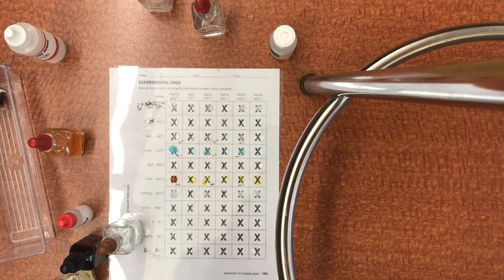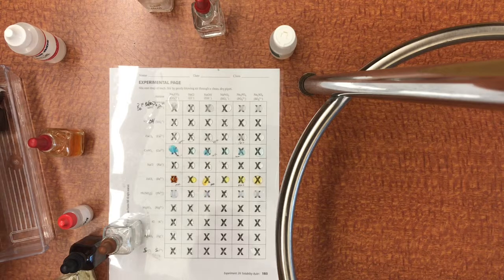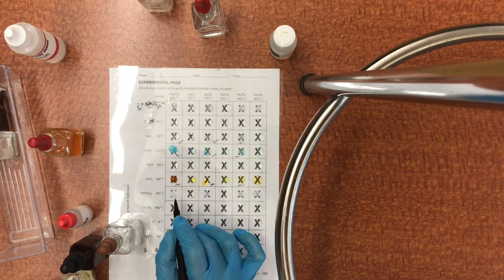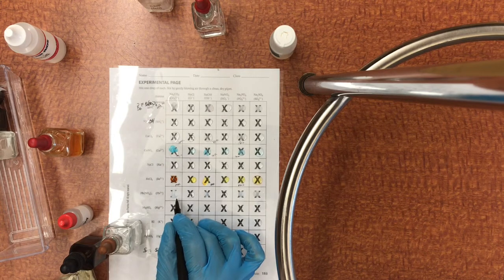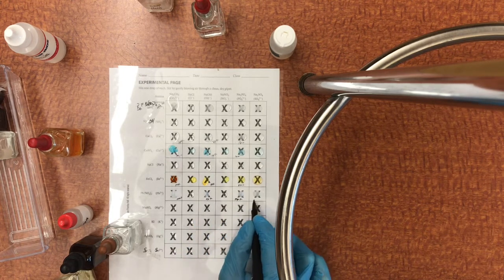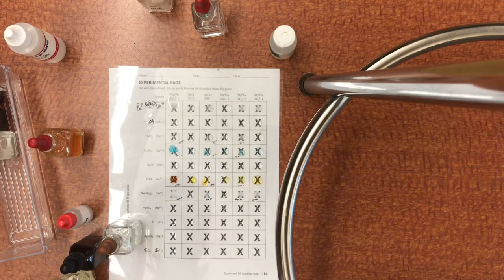It's a bit on the smaller side of the ions. It's also one of the metals, or especially the weak metals. It's in the main group, so it's below carbon. It's in the same group as carbon. So that gives it some interesting bonding abilities because of its s and p orbitals. So here we got a strong precipitate. So typically bonds or ionic bonds with lead are very strong, and so it doesn't actually really have much interest in being dissolved in water.